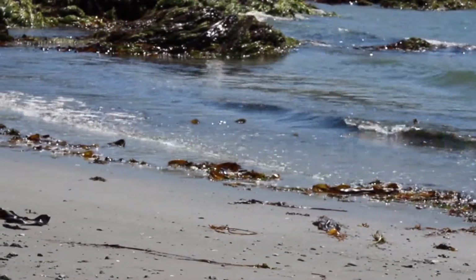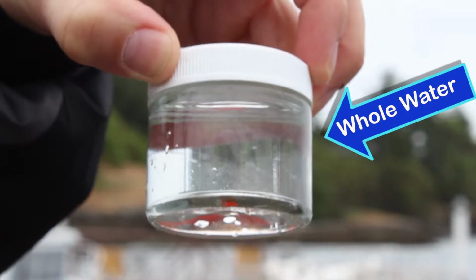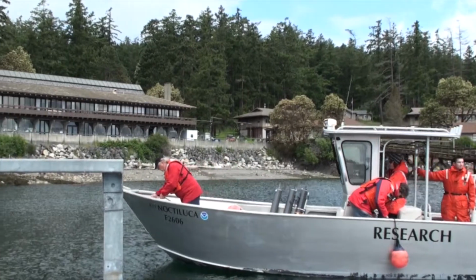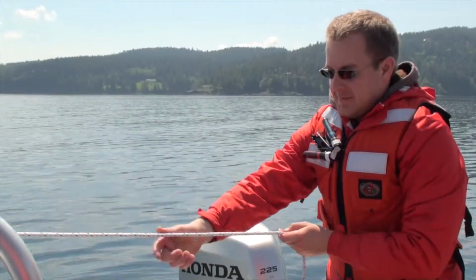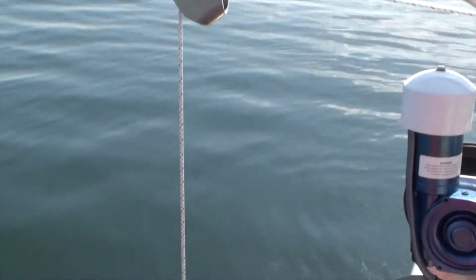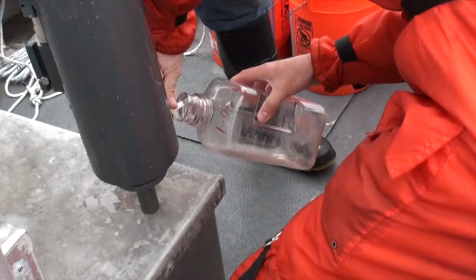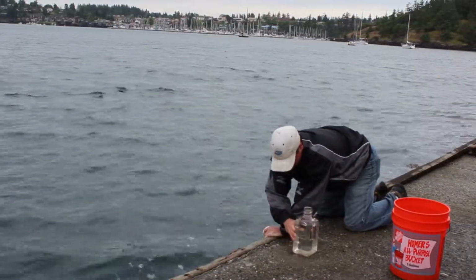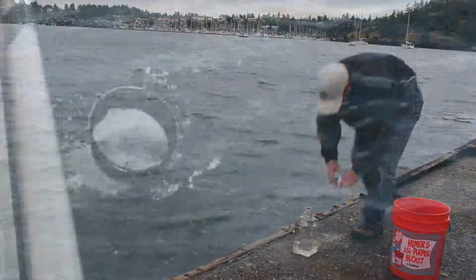The most straightforward way to sample is to collect a whole water sample. This can be taken from a dock or while on a boat of either the surface of the water or somewhere deeper in the water column. Whole water samples are usually collected using Niskin bottles and then transferred into smaller jars for later analysis. Surface water can be collected directly into a container.